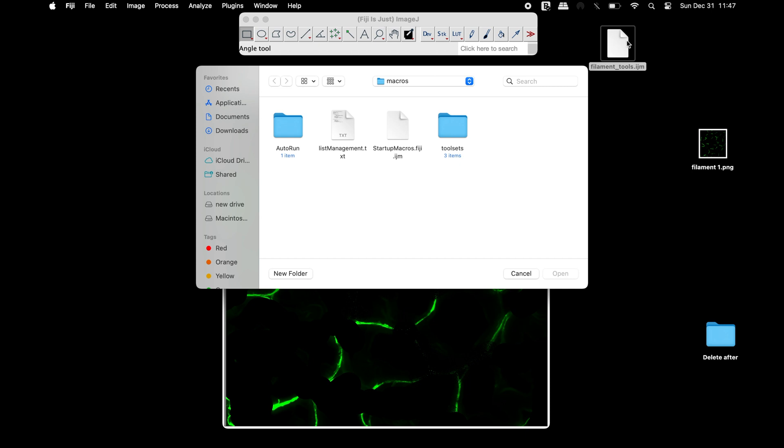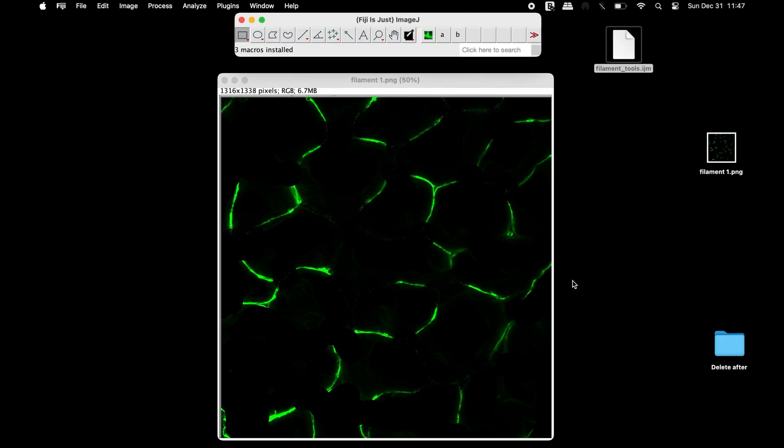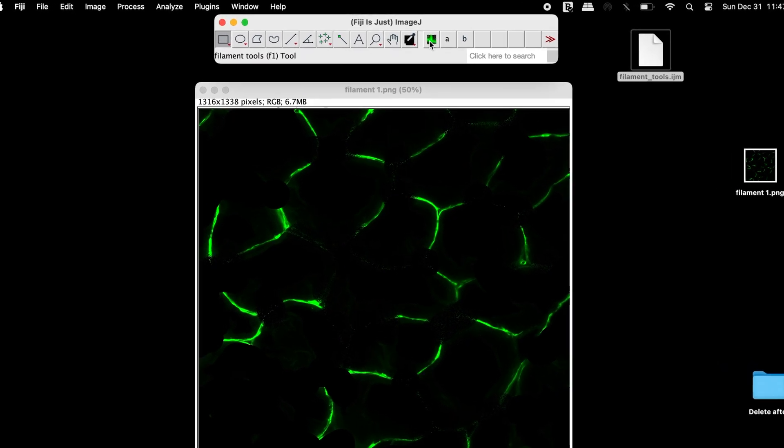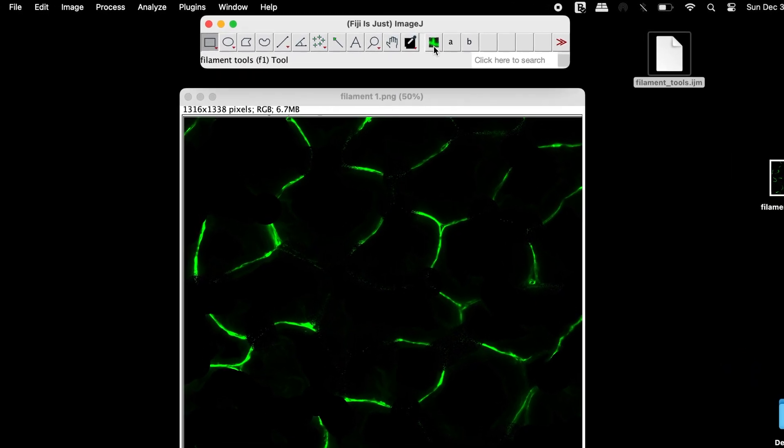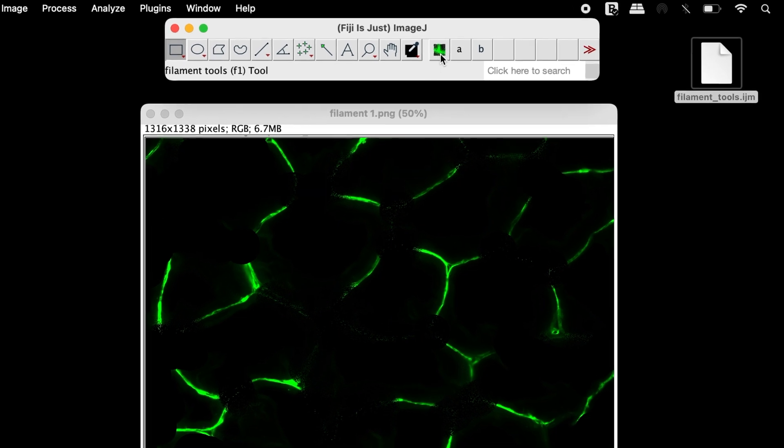After installation, a restart of Fiji may be needed. Upon successful installation of the macro, three icons can be seen in the Fiji toolbar.